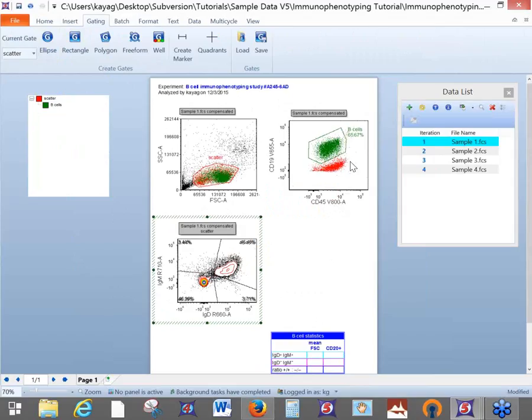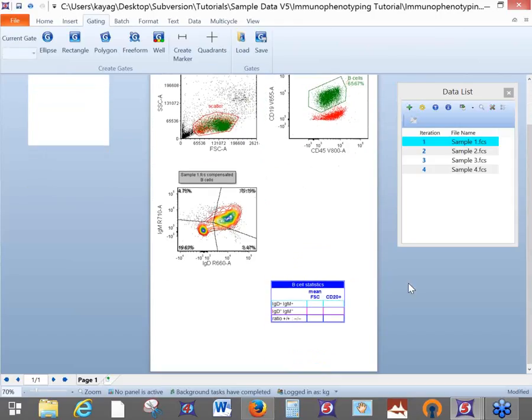So I can do a control click and highlight both of these and say that I want to gate both of these on no gate, for instance, or B cells. Okay, but let's keep this one gated on scatter. So those are the ways that you can apply gates in FCS Express. It's fairly intuitive.